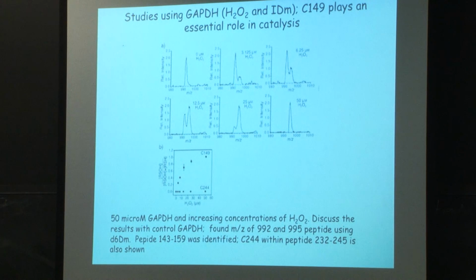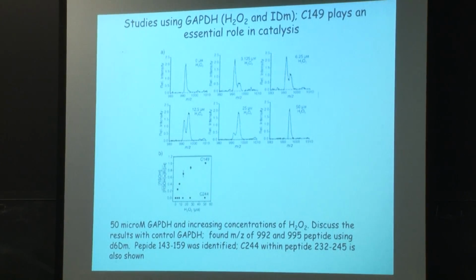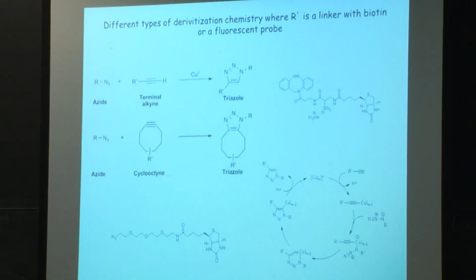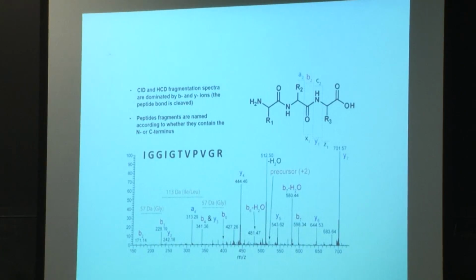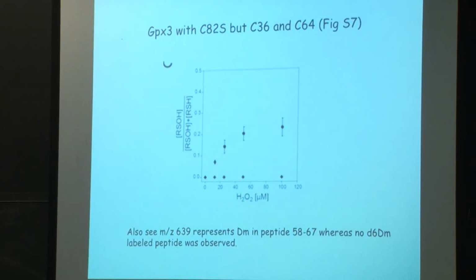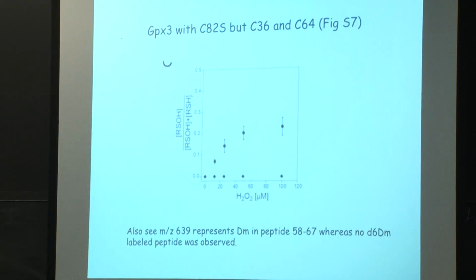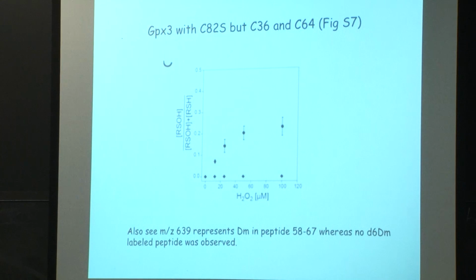In the other slide, was there only one cysteine in the fragment of the protein that they sent to the mass spec? No, so they mutated this, so they now had 2 cysteines, the one in the active site, and another cysteine, cysteine 64.